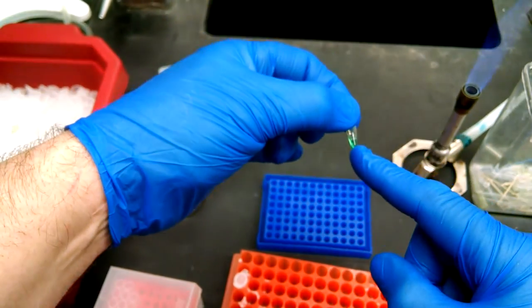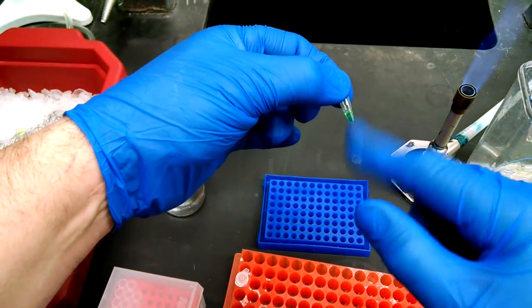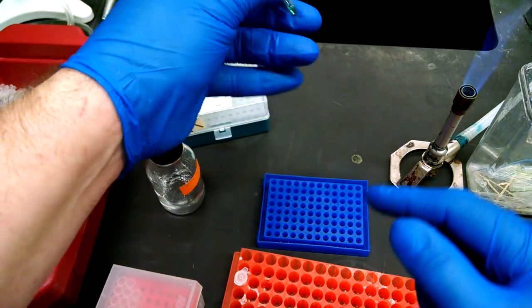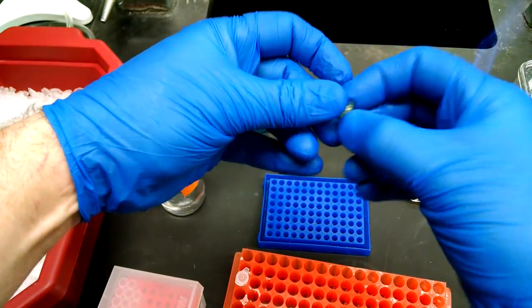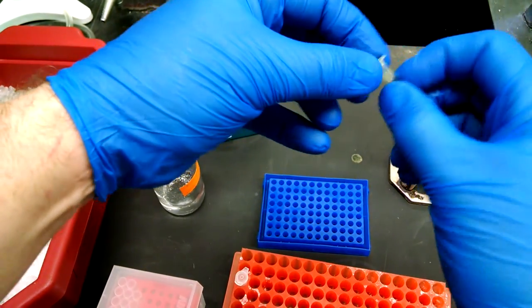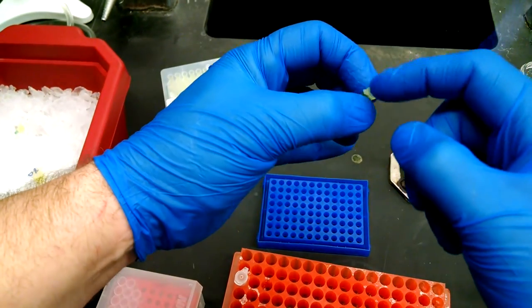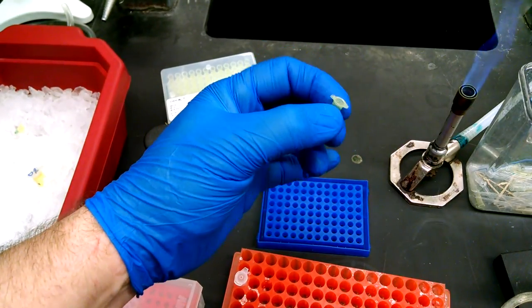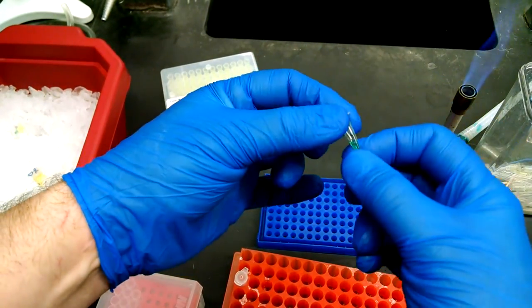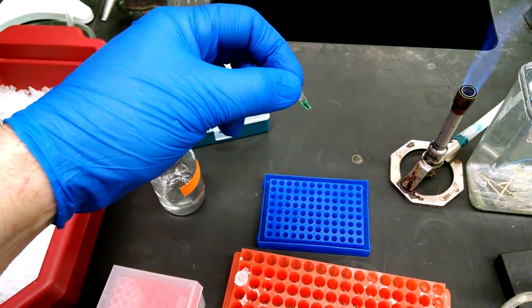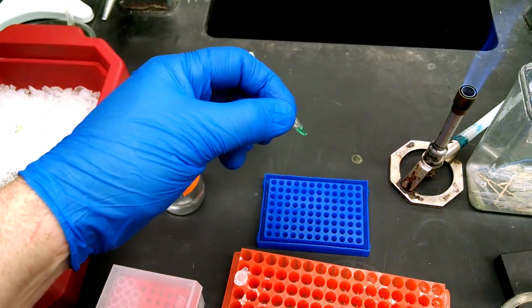Don't vortex this. Enzymes hate to be vortexed. You can give it a little flick to mix. You can invert it to mix. Just make sure the cap was closed first and flick it back down to the bottom of the tube. Put some sort of little symbol on the top to help you find it. You're not going to be able to write your name on it. It's too small. Take it to the PCR machine. Make sure you fill out the sign up sheet so we can find it again. And good luck.